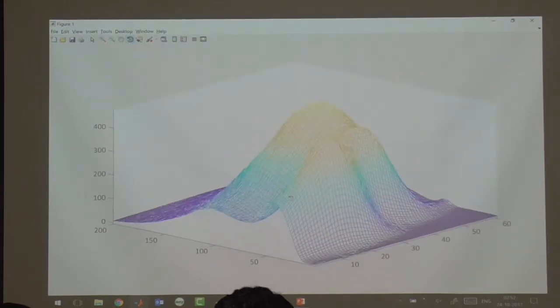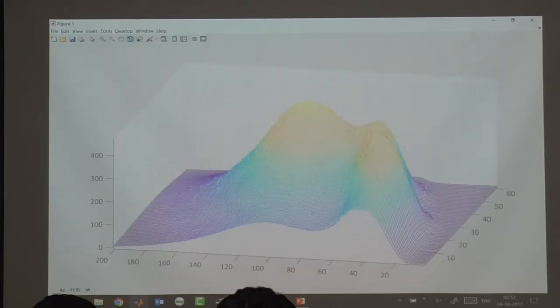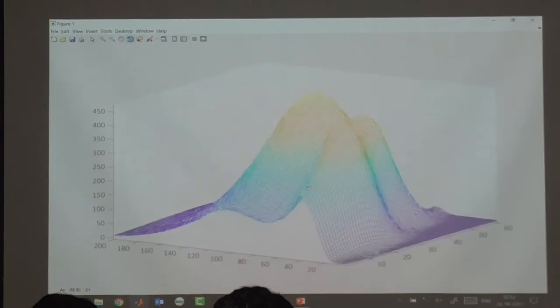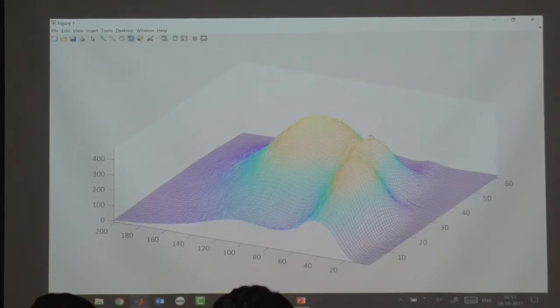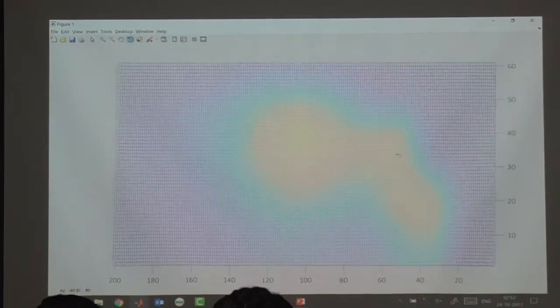Does it make sense that this is a matrix? So in each element, so the first excitation and the first emission, I have an intensity. That's the number. So all the elements are just the intensity, actually the photons counted. So this is one matrix, one landscape. One sample, just one sample. And you can kind of see that it has three components. So it's probably rank three.